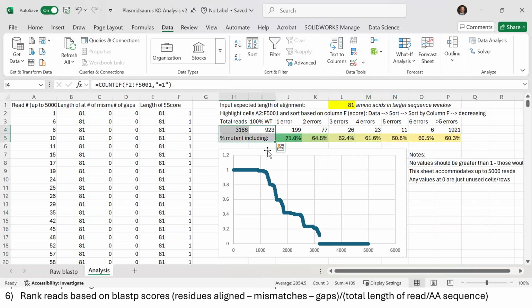So if I wanted to make sure I had a more homogeneous population in which all of those cells were missing the correct function or correct and functional version of this protein, I'd probably go back and tweak something. So add more Cas9, add more guide RNA, maybe change the electroporation settings if that's how you're delivering this, so on and so forth, right?